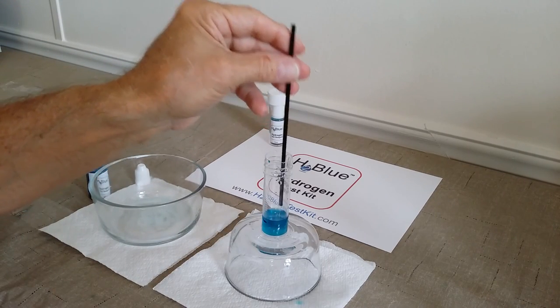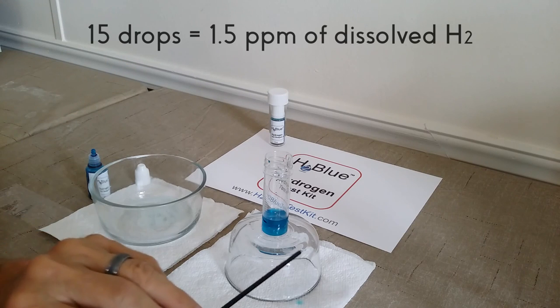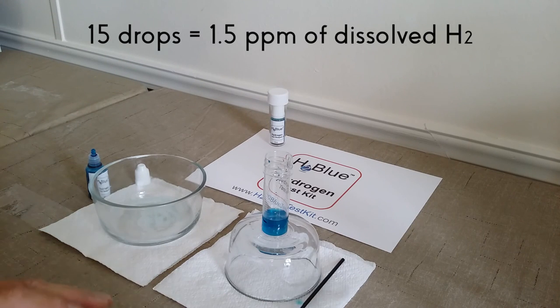And as you can see, that 15th drop turns blue and stays blue, so I know I've reached the titration endpoint. So that's all there is to it.